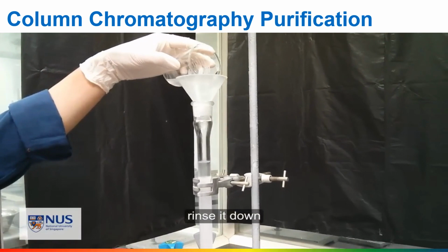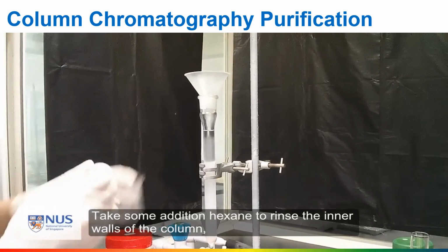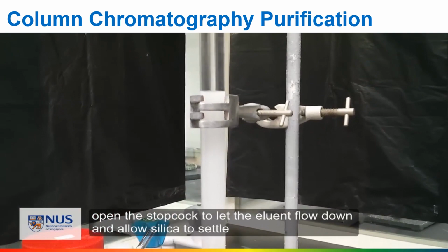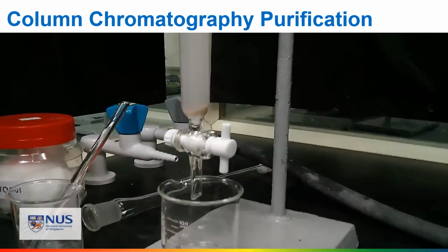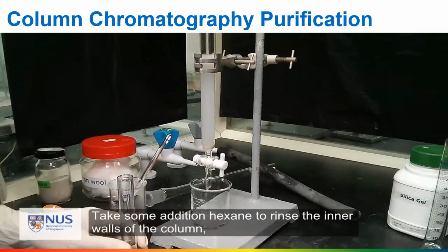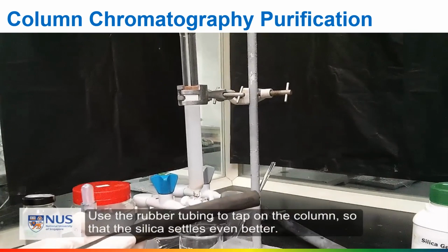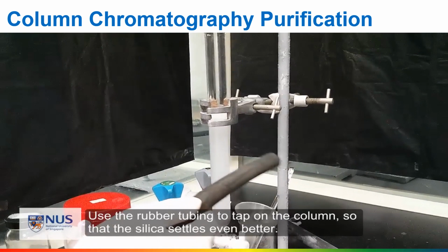Take some additional hexane to rinse the inner walls of the column. Open the stopcock to allow the silica to settle. At all times, the column must be vertical. Use the rubber tubing to tap on the column so that the silica settles even better.